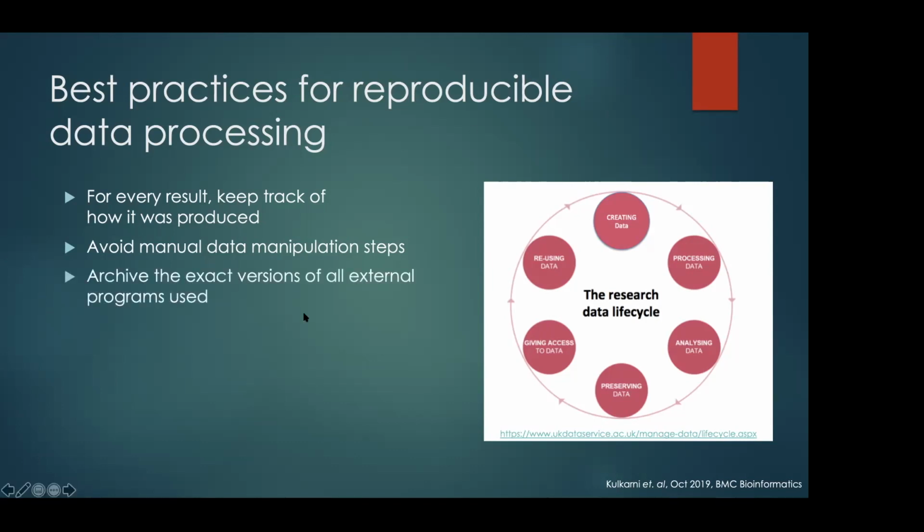And archiving the exact versions of all programs you're using, especially external programs, or also internal programs. For example, when you do differential expression analysis every other week, they are changing something in DESeq2. They have a minor version. When you take two minor versions, sometimes you don't get the same results, using exactly the same version but the minor versions are different. You cannot reproduce your results. So this is extremely important. You have to get a snapshot of all the versions you have. Even if you note them, sometimes you cannot even install right.